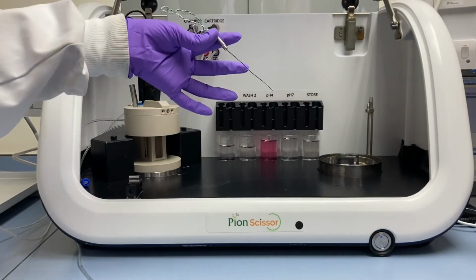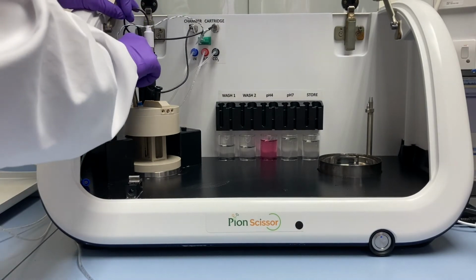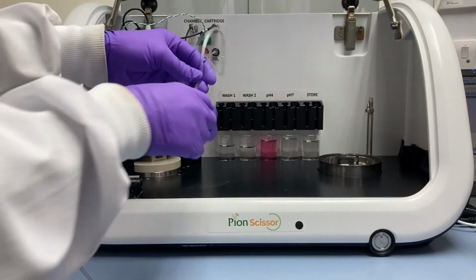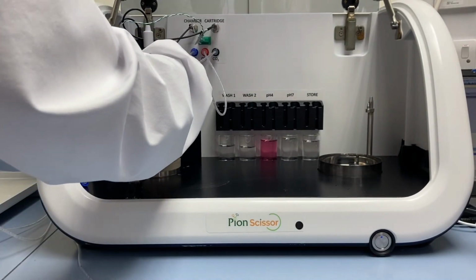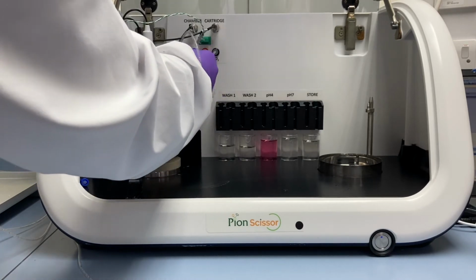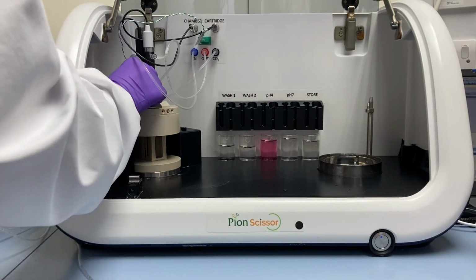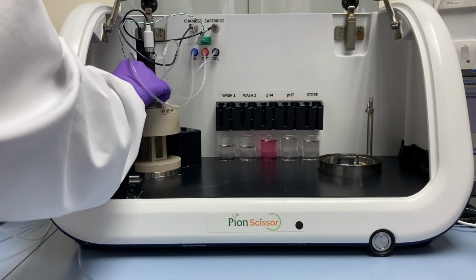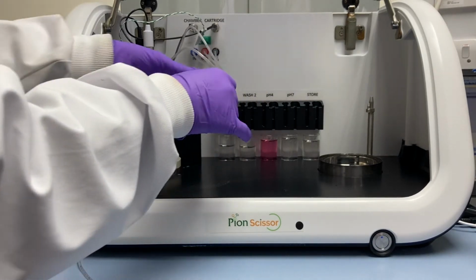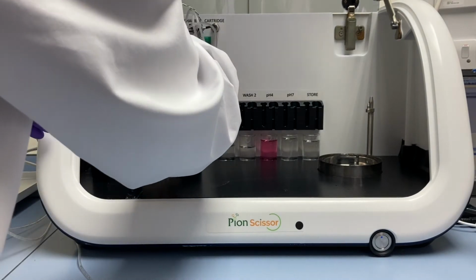After the pH probes, we add the thermocouple, which helps maintain the assay temperature, followed by the tubing to the chamber, with the red line indicating fluid leaving the chamber and the blue line fluid entering the chamber. The system is a closed loop and allows for the Gilson autosampler to remove aliquots of the chamber buffer at predetermined time intervals via the external flow-through valve for offline analysis. The black line is the CO2 line running to the external CO2 source.